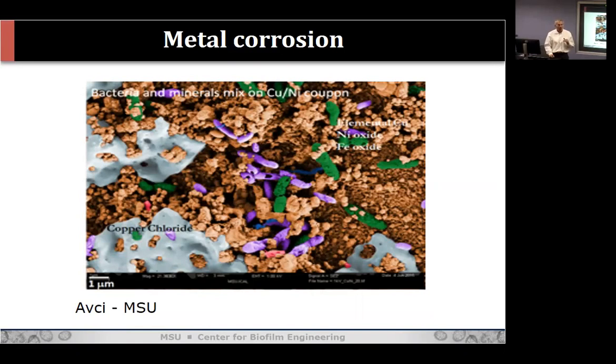But I wanted to show it because the facility that this was taken at, also right next door here at MSU in our imaging chemical analysis lab, is also one of the facilities that falls under the MONT umbrella. And this kind of microscopy is complementary to the fluorescence microscopy we're talking more about today.